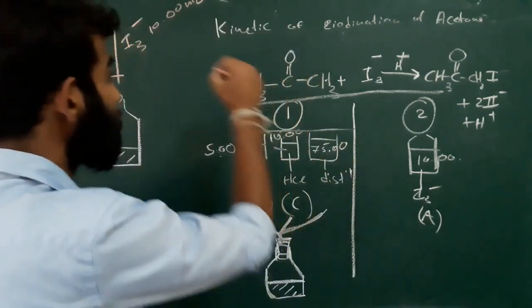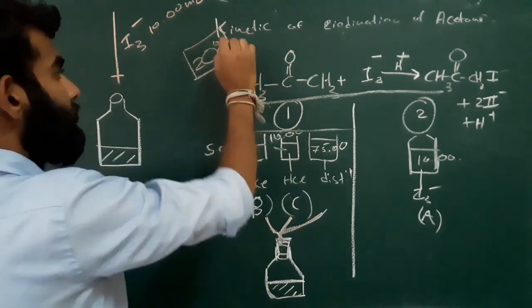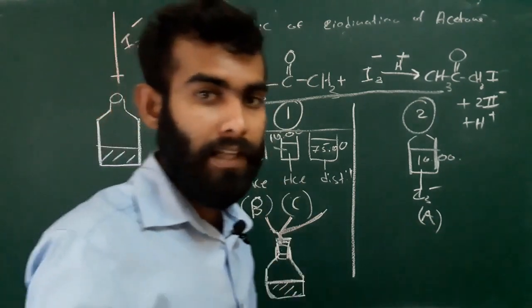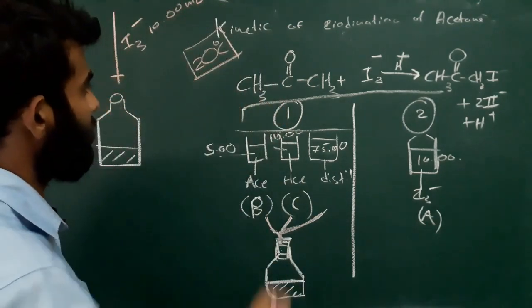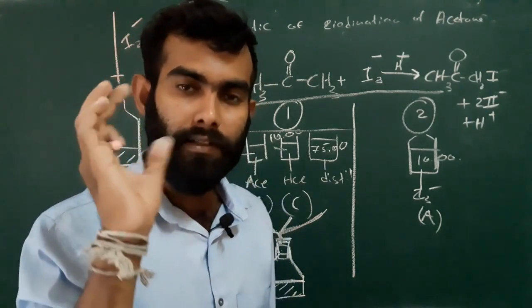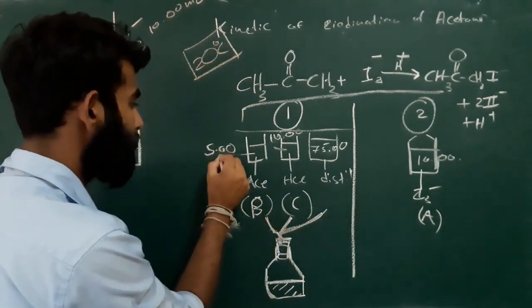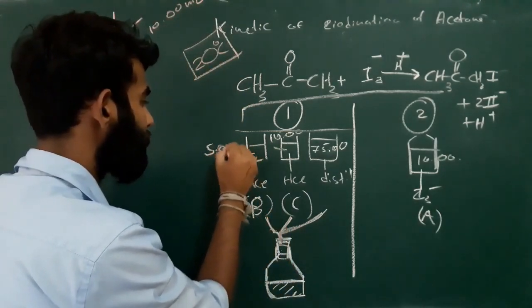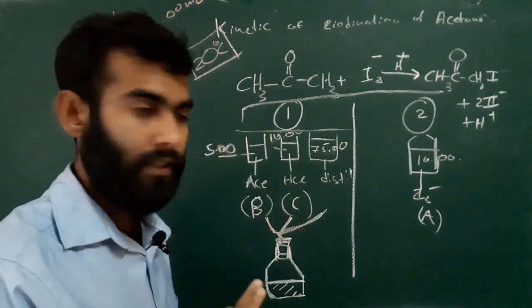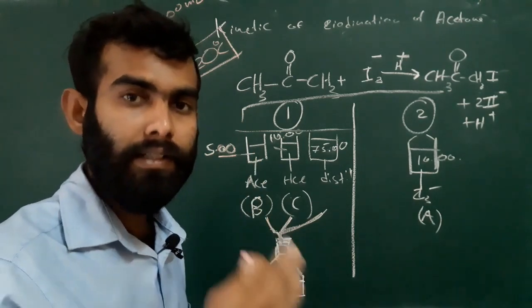They mention the temperature as 20 Celsius. Very important things: first thing is volumes. They mention 2 decimal points, which means the accuracy should be very high.